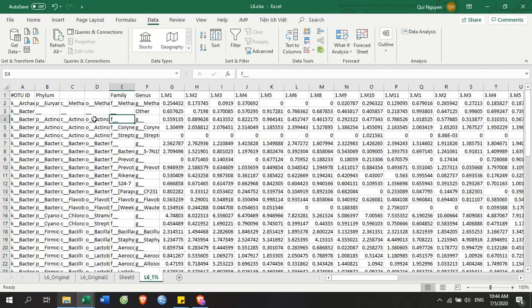So in this case, I will copy the previous known taxa, which in this case is order. We know this here, and genus we can label the same. For this also, we label. This genus is unknown, so we use this information. For this unknown, use the previous known information.